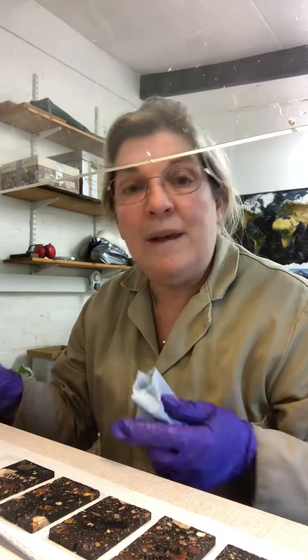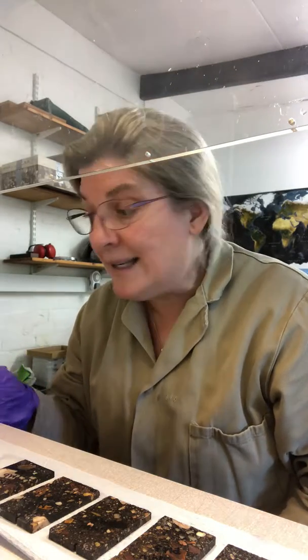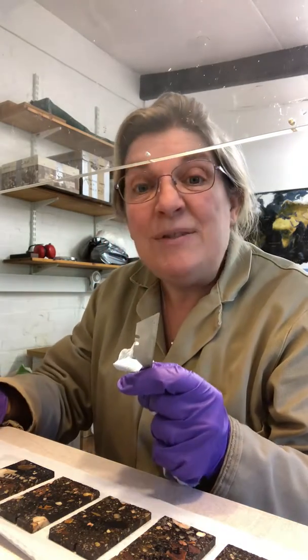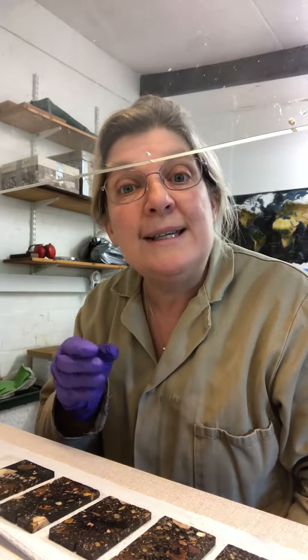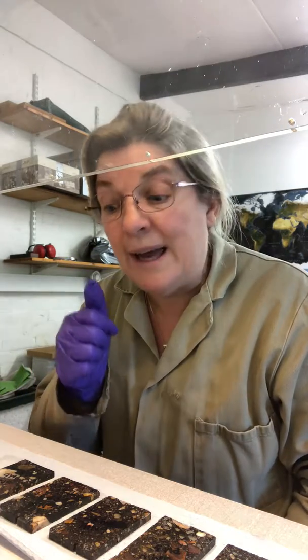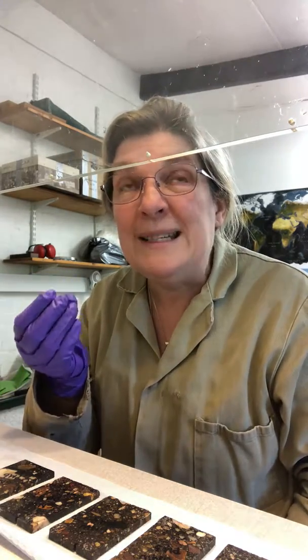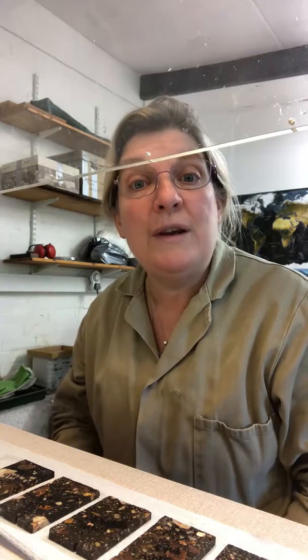remember the rule of flooding your samples with acetone. These I released off the glass with my wonderful little Stanley knife blade, and I have to say they were a bit difficult, and you have difficulty when the super glue saturates into either a poorly cured sample slice or saturates into the fabric of a rock, a porous rock. And of course, these are filled with rocks. So the super glue did do a little bit of saturating, but I did manage to get them off with no breaking of corners.